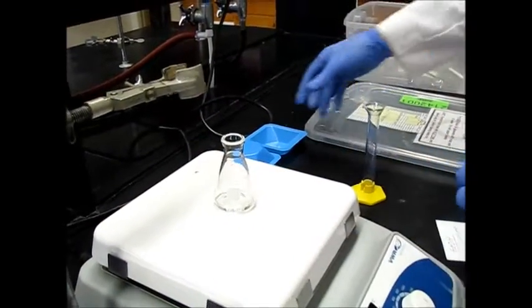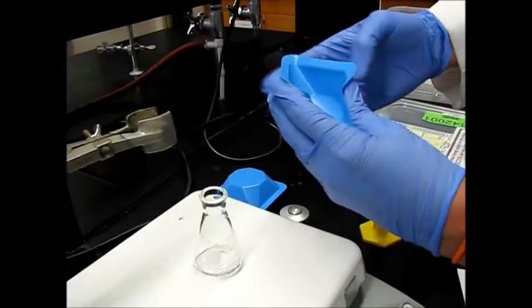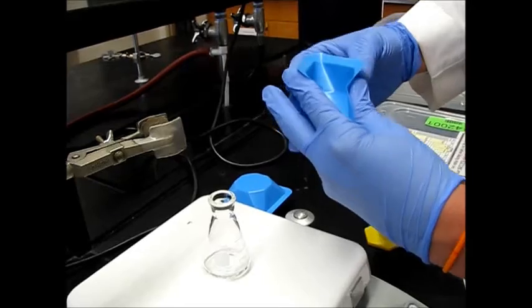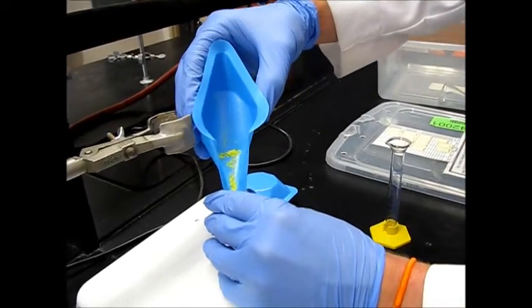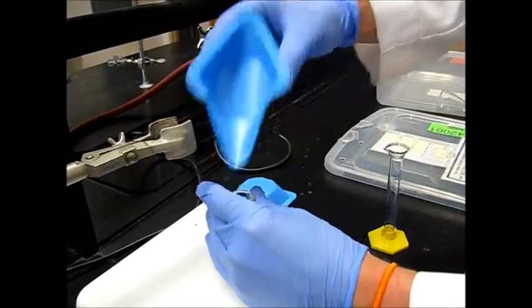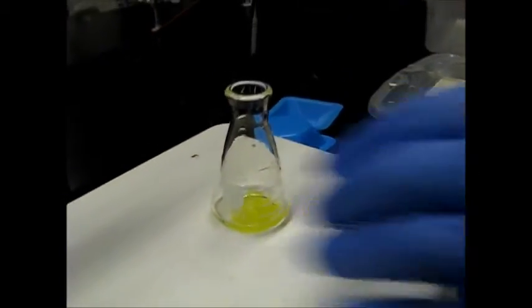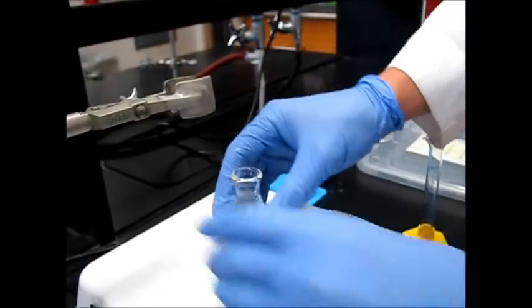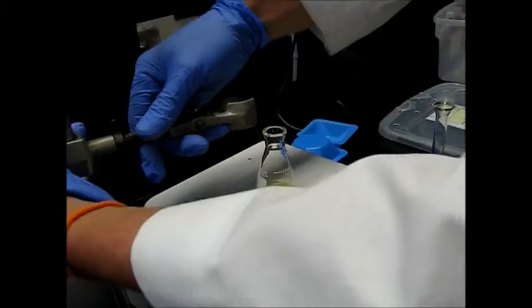So we're going to go ahead and add our reagents right now. This is our 9-fluorenone. I always like to bend the weigh boat so I can get a nice funnel going. Just kind of pour stuff in. Cool. Now we're going to add our stir bar. Turn on the stirring plate, and we're going to go ahead and clamp this down so that it doesn't move around.